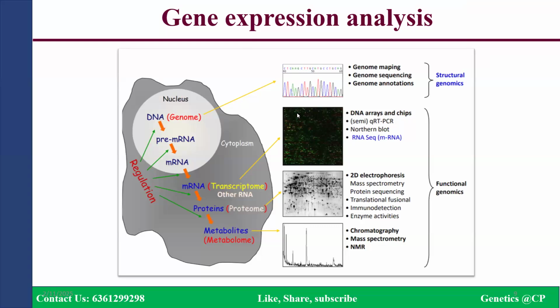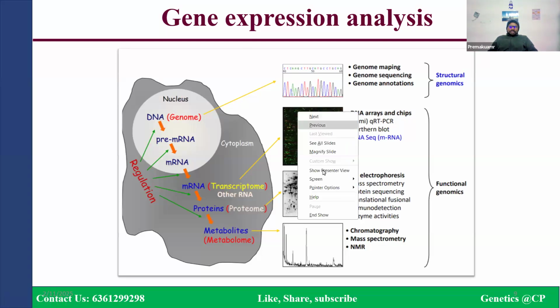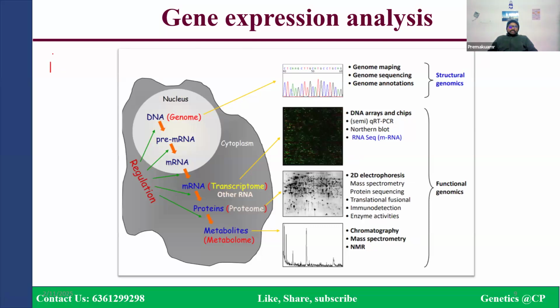Yesterday we were discussing DNA sequencing. We discussed how we can sequence DNA with the different platforms: first generation sequencing, next generation sequencing, and third generation sequencing. And we just looked at the overall summary of the NGS workflow.